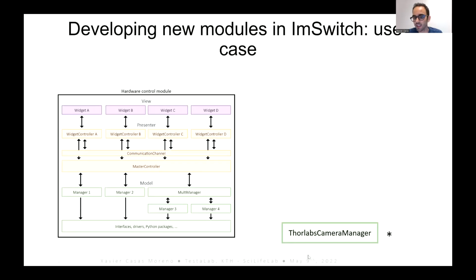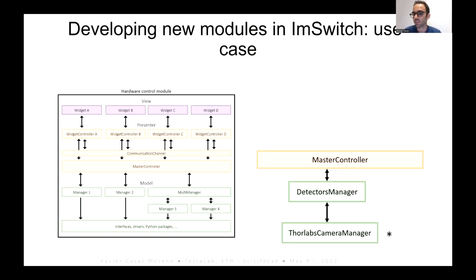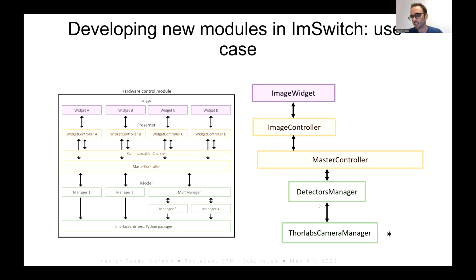For that, as I said, we will have to generate a Thorlabs camera manager. That is going to be a specific type of detectors manager. I also explained this in my presentation, but a detectors manager is a type of multi-manager that handles whenever we want to use many different detectors at the same time, and for it to be integrated in Napari and the image viewer. That is going to be part of the master controller that has access to them. And as long as this is a type of detector, it will be automatically integrated in the graphical interface.